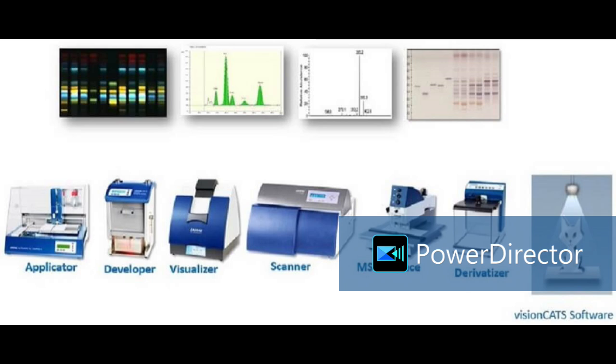Okay. Do you refill with the chromato agent for derivatization? Yes. How frequently it has to be done? As in when it's manual or it is also automatic? It is automatic, ma'am. Here we need to add reagent in this nozzle and just press this button. So it will start spraying the reagent onto the plate. The reagent will fall onto the plate in the form of aerosols.